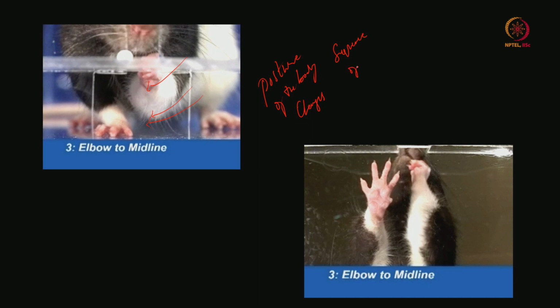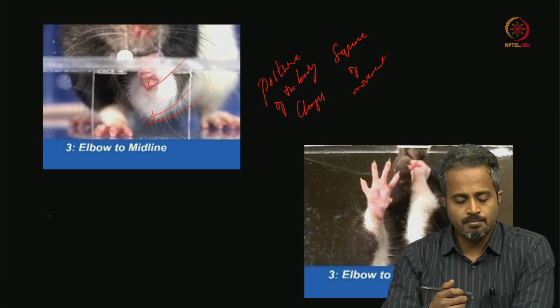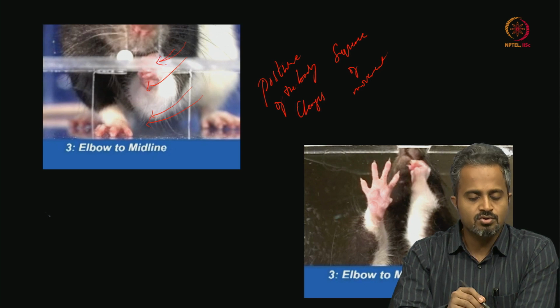This is what we usually call ergonomics in humans. In order to make the movement efficient, you will arrange your body and your footstep automatically, so that your hand makes a finer movement which is close, small and pretty precise. Here the precise movement is that it is going to pass the hand through the slit.